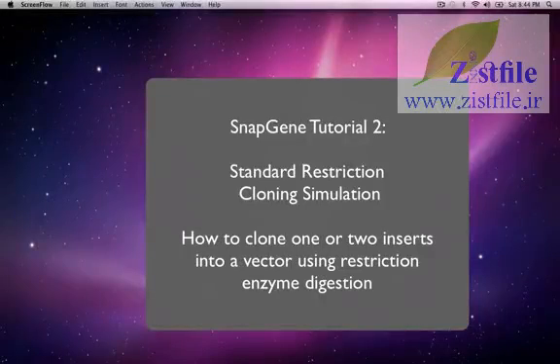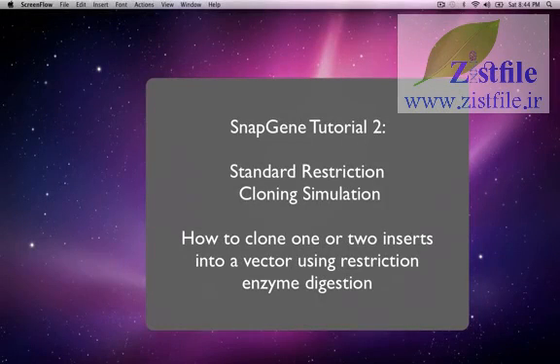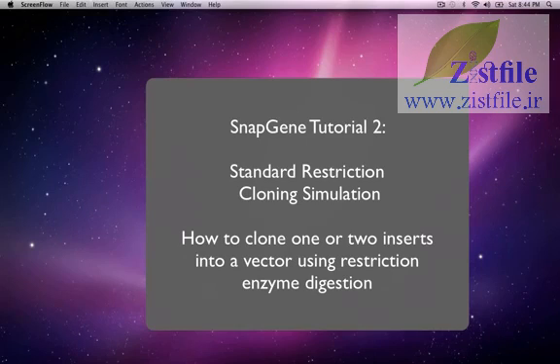This video will demonstrate how SnapGene can be used to simulate standard restriction cloning. Let's start with a simple example.